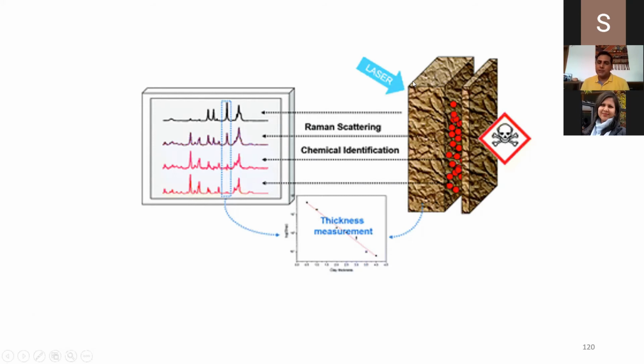You can do this horizontally, meaning a plane-wise analysis at a particular plane. What is my concentration change here? If you focus at this side, left and right, and your intensities are changing while moving on a particular horizontal plane, it means your sample is again not uniform. So you can do the horizontal analysis, you can do vertical analysis, just to find how much change there is. If your changes are allowed, you do it. If not, you have to change your sample or control your manufacturing process.